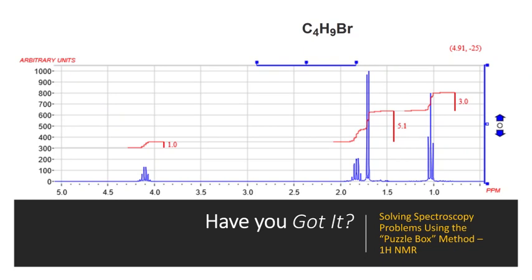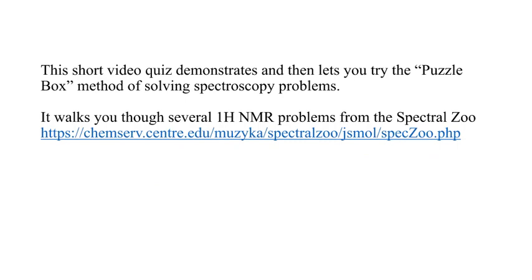Solving spectroscopy problems using the puzzle box method, proton NMR. Have you got it? This short video quiz demonstrates and then lets you try the puzzle box method of solving spectroscopy problems. It walks you through several proton NMR problems from the spectral zoo.